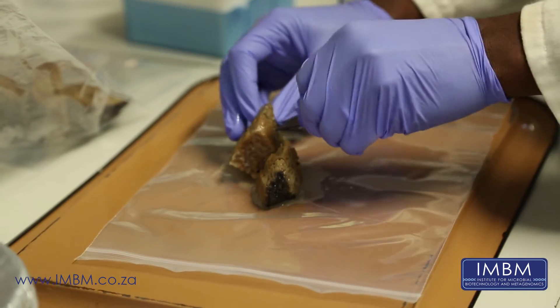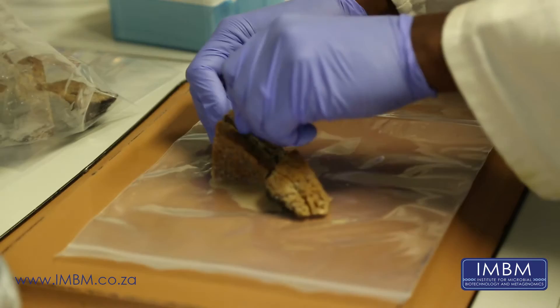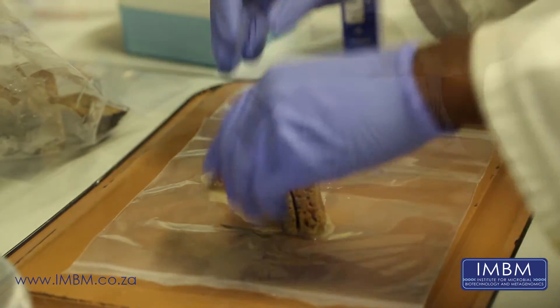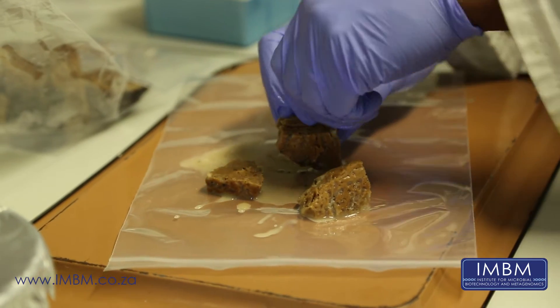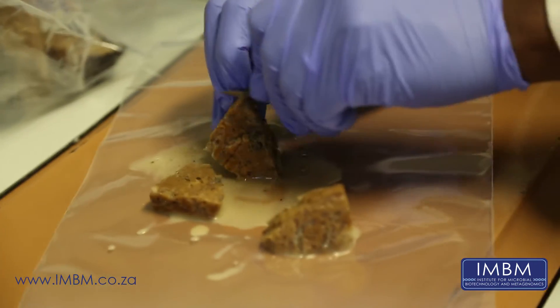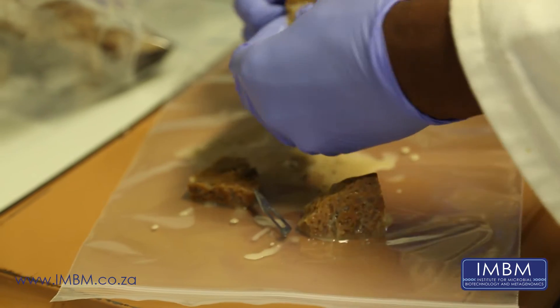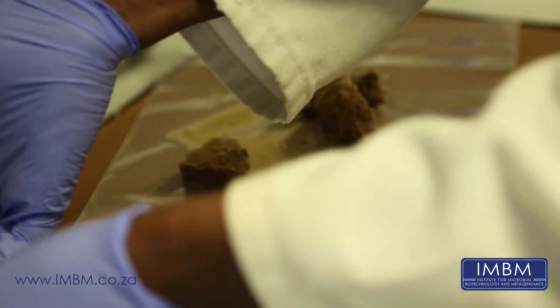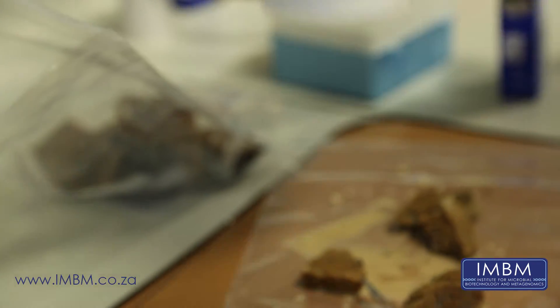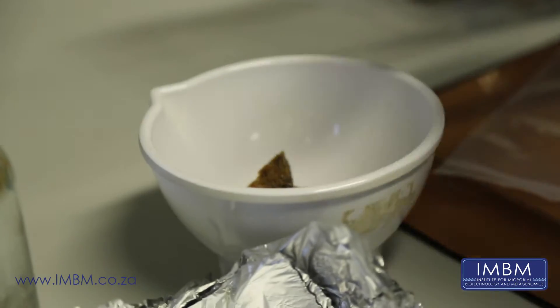To be able to get at the bacteria, we have to take our sponge sample and cut it up. It's important to remember that since we're interested in the bacteria within the sponge, we have to try to keep everything as sterile as possible. We don't want to find ourselves working with bacteria that are lying around on the bench, which is why we wear gloves and keep everything sterile — like our mortar and pestle, which we had autoclaved to ensure they were absolutely sterile.